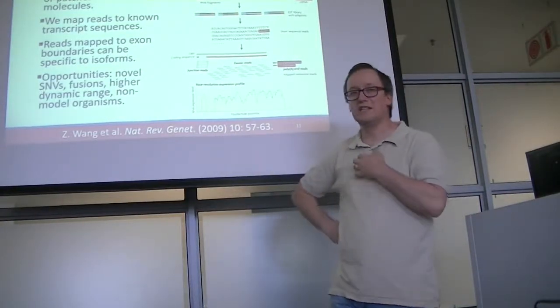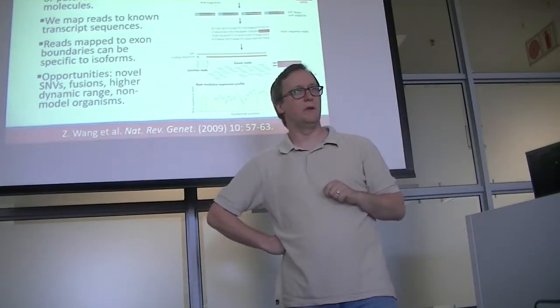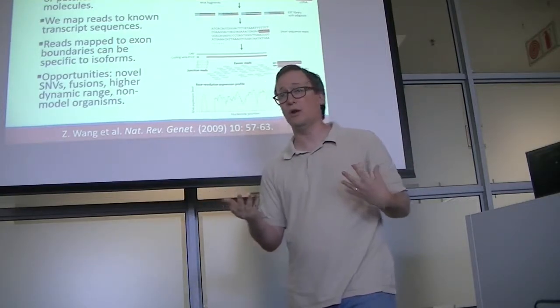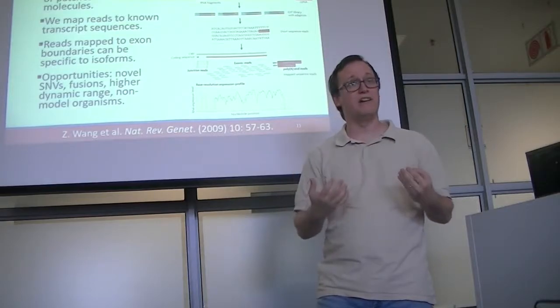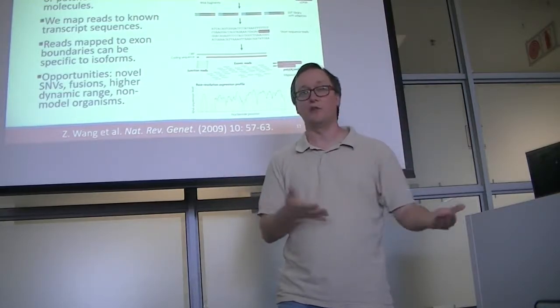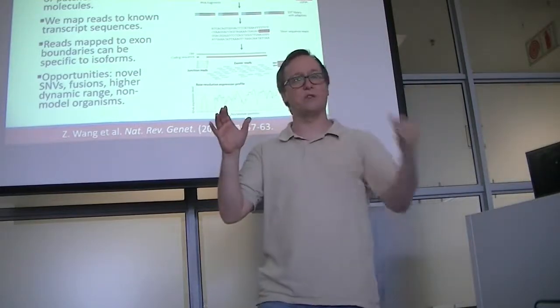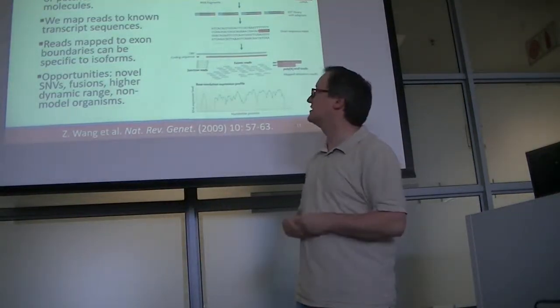It is possible to capture the 3' ends of messenger RNAs and sequence there. More commonly, in RNA-Seq style experiments, we will see people trying to capture sequence from all different patches across the transcripts. One of the most common things that we see in interpreting RNA-Seq data is a mapping process. We know all of the messenger RNA transcripts that are projected for the human transcriptome. Therefore, if we sequence a bit of cDNA in an RNA-Seq experiment, we can figure out if it associates with this or that protein coding gene pretty straightforwardly. So this mapping process is one of the common ways that we go about making sense of our data.